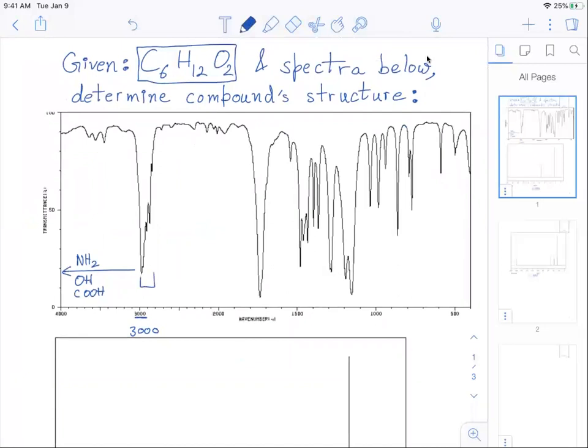What we do see is kind of a simple linear peak here which usually tells you there's an SP3 carbon hydrogen bond. It doesn't tell you what's bonded here. It just tells you there's an SP3 carbon hydrogen bond and there's a few of them. So that's one takeaway and we can ignore all this. Other takeaways you always look at the 1700 because you're looking for the carbon oxygen double bond that lies around there.